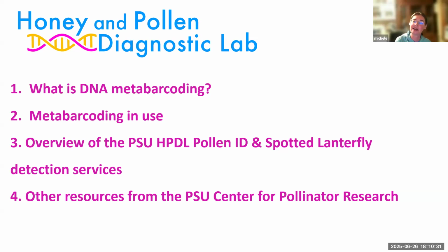But I'll talk about what metabarcoding is, a little bit about how specifically pollen metabarcoding is used, a little bit of overview of our pollen identification service and spotted lanternfly, which I really, really hope you guys never, ever need to send honey in for that to be tested. Here's to hoping. And then I'll also showcase some of the other resources that the Center for Pollinator Research offers, and talk about some of the new services that I'm hoping to offer sooner rather than later. Because right now we have 2 services, and I would like to become more comprehensive.